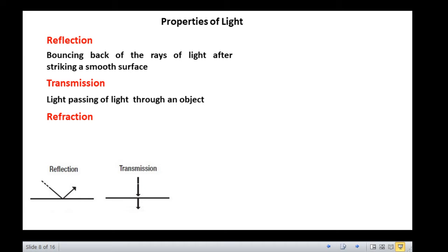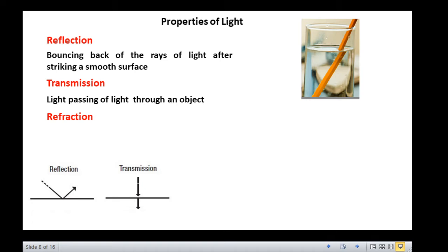We know that a ray of light travels in a straight line in a given medium like air. But what happens when light passes from one medium to another? This can be understood by a simple activity. Keep a stick in a standing position in a beaker half filled with water. The stick appears bent at the water-air interface.